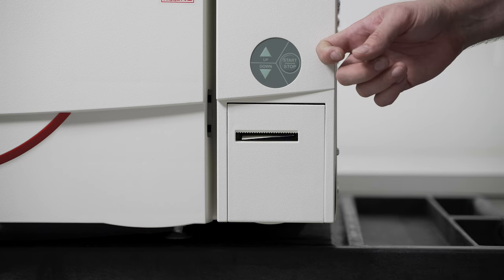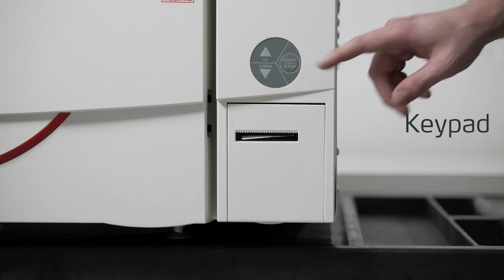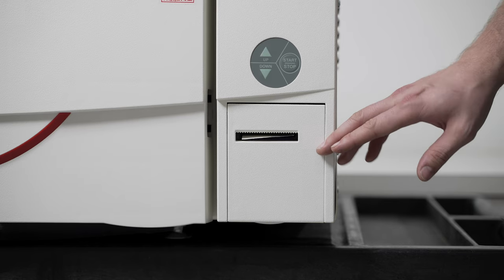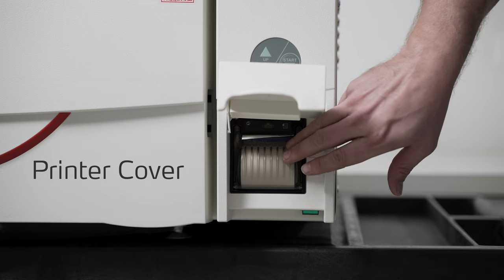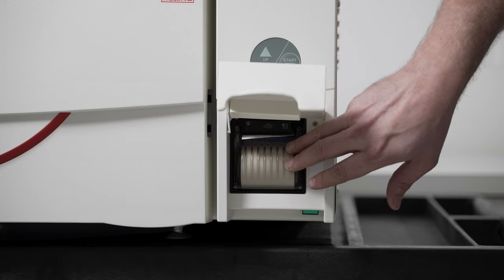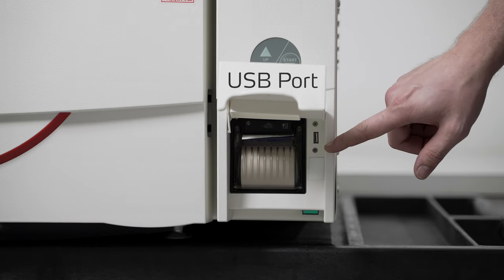Here we have the three button keypad with the up and down arrows as well as the start/stop button. This will be the majority of the way you'll be interacting with the menuing on the unit. Below that we have the printer cover which houses the printer itself, which gives you the live reading from the cycle data while the cycle is running. Beside that we have the USB port for importing and exporting cycle data.